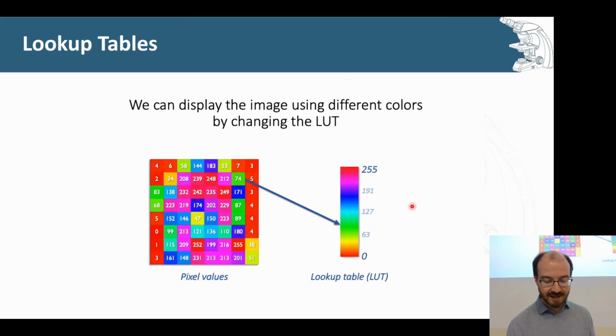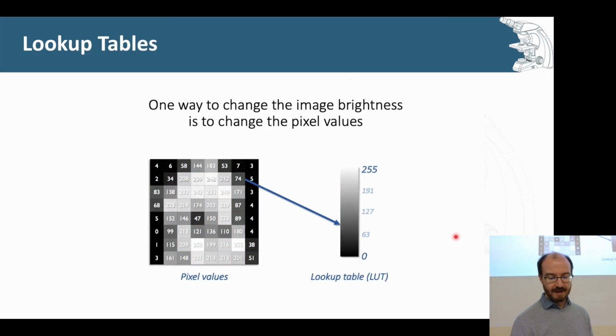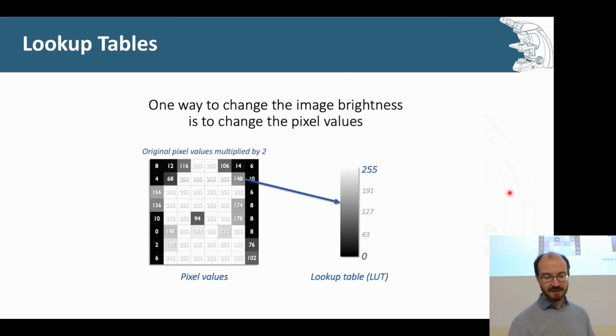And I can decide exactly what color map I want to use here. This color map or lookup table is purely chosen to help us in the visualization. It's got no benefit for the actual quantification analysis. It's only for visualization, for communicating to someone else, to say, hey, you can clearly see these structures forming here. Certain lookup tables help more with that than others. And I think there's an example coming soon to demonstrate that.